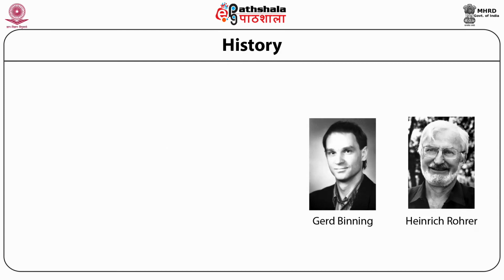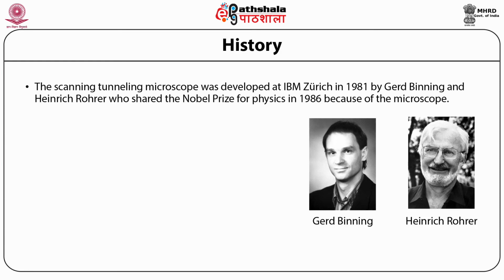So let us discuss the history of the scanning tunneling microscope. It was developed at IBM Zurich in 1981 by Gerd Binning and Heinrich Rohrer, who shared the Nobel Prize for Physics in 1986 because of the microscope.